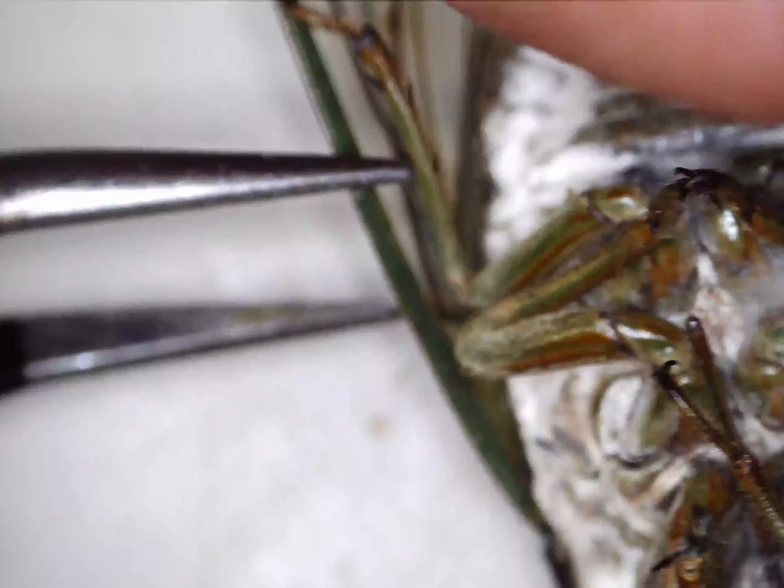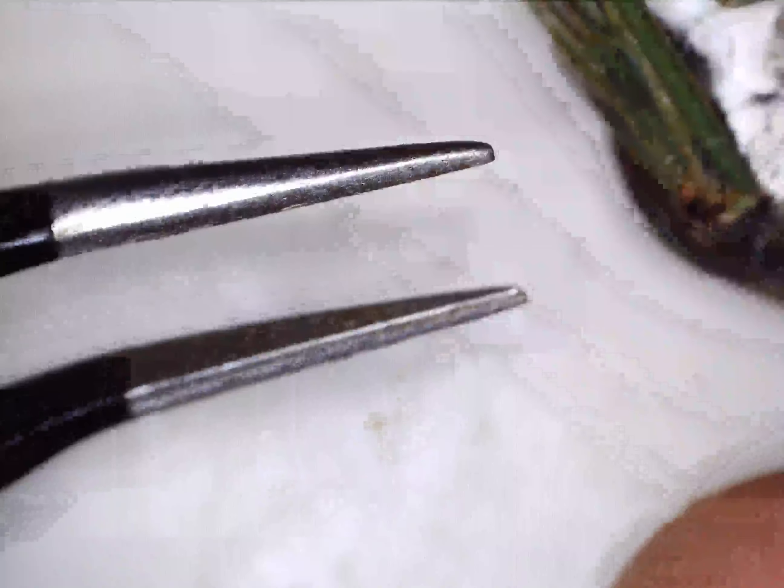If you didn't watch the last video, just a little background on these: they start off as a little worm-type thing, almost like a little beetle.